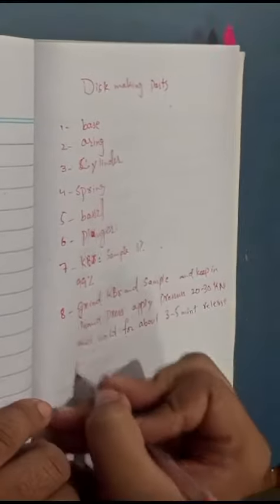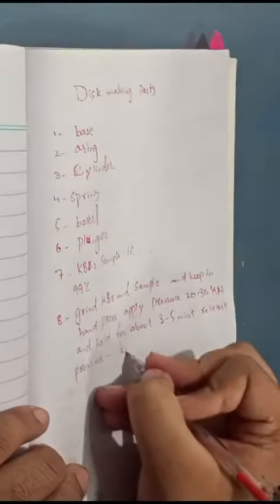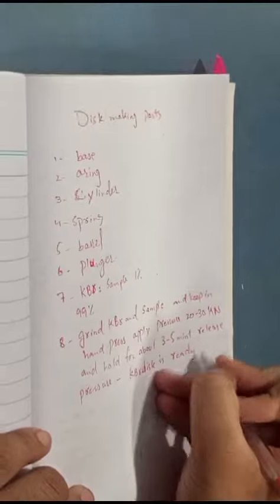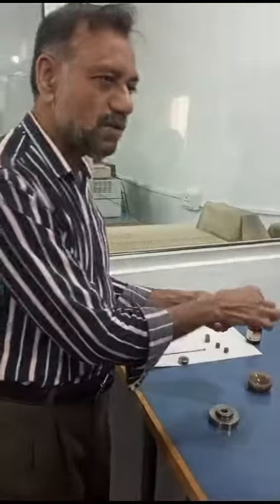Release pressure. KBR disc is ready. 3 to 100 each.